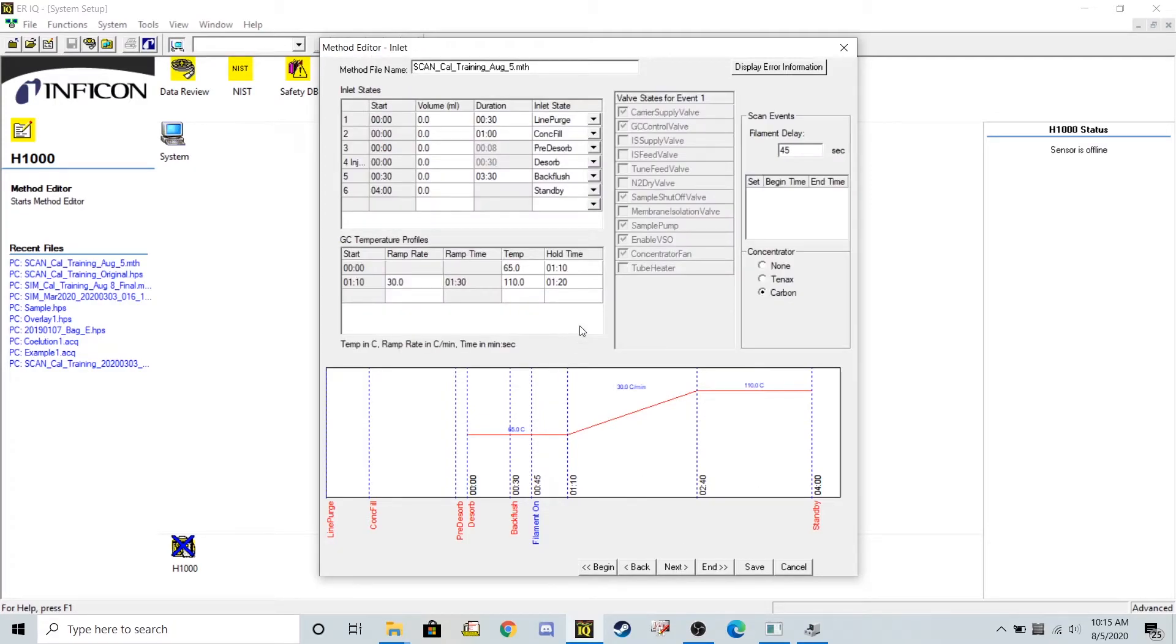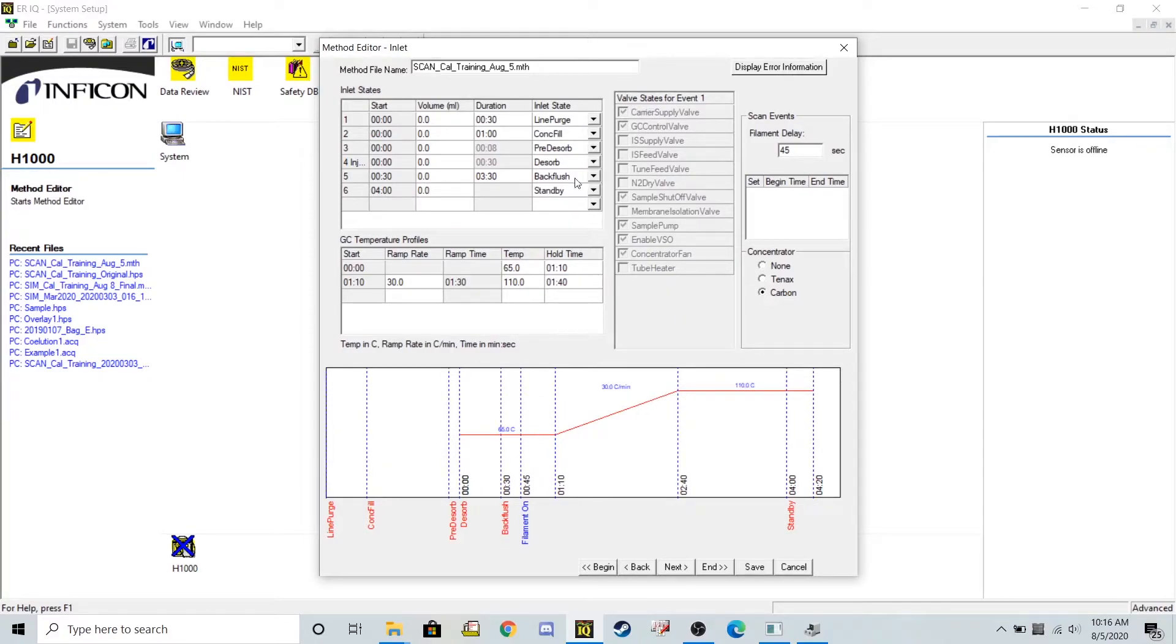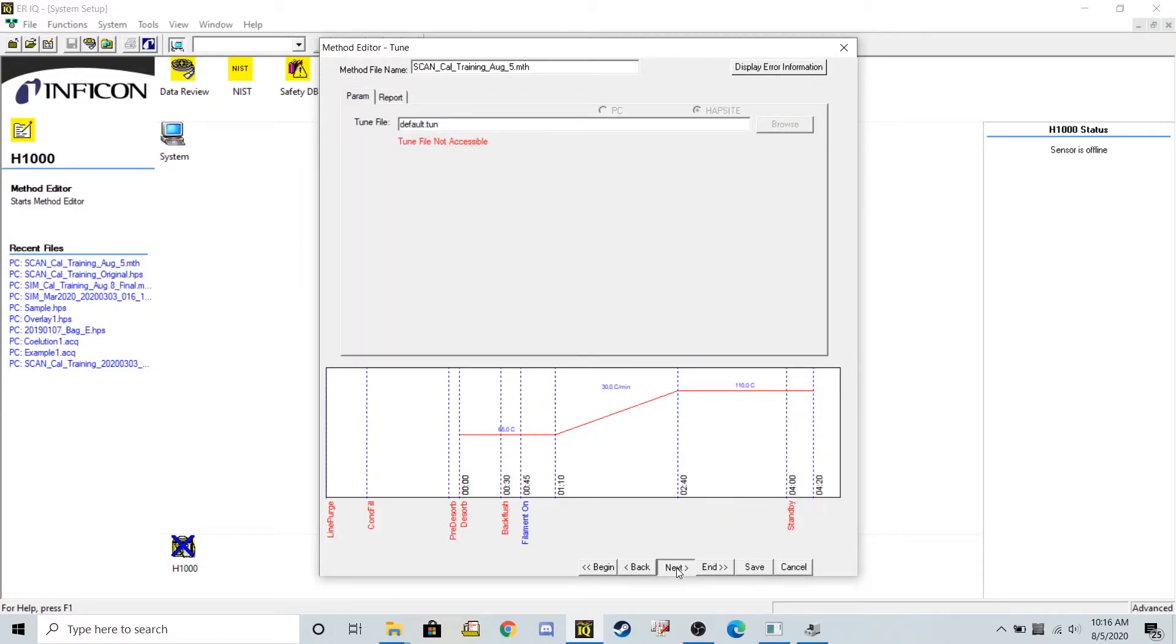You want to see the entire GC peak come out. So I'm actually going to extend my method out just a little bit. Let's say another 20 seconds should be more than enough, so about a minute and 40 at the end. Internal standard not checked. At this point, I can move on.